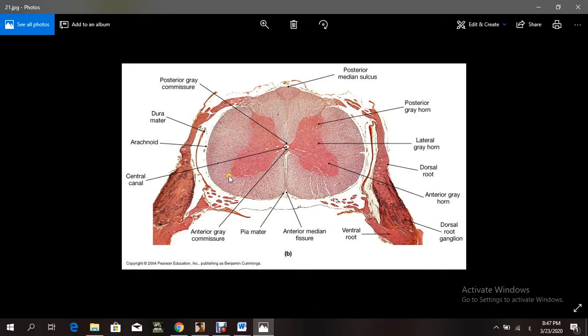In the ventral horn we said there are motor neurons, and as we can see in the dorsal root ganglia, neuronal cell bodies. We said a ganglion means an aggregation of neuronal cell bodies outside the central nervous system. Those are the neurons. Usually in the dorsal root ganglia, the perikaryon or neuronal cell bodies are fairly aggregated on one part of the ganglia.